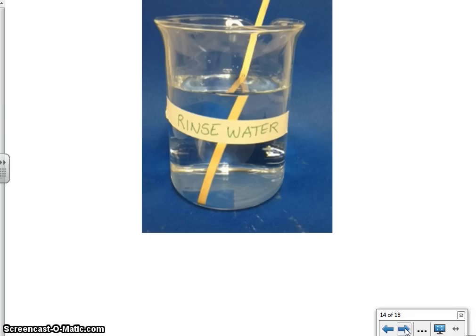When you are done using a splint, there should be a beaker at your desk called rinse water. This is where you extinguish any burning splints, and you leave those splints to soak. You do not reuse those. Okay, once they have a chemical on them, they're contaminated, and it really never comes off. So just leave the used sticks in the rinse water, and at the end of the lab you can dispose of the sticks.